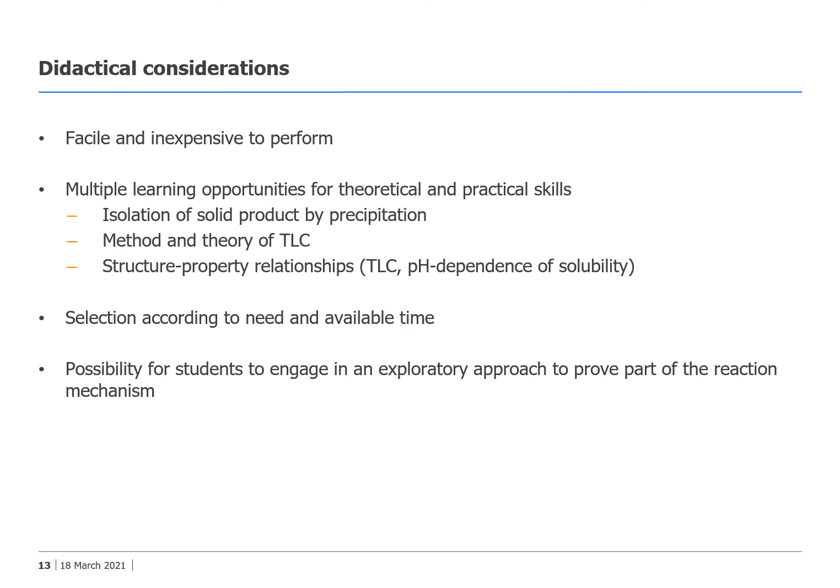Finally, the possibility should be mentioned to let the students engage in an exploratory approach to prove part of the reaction mechanism via the bromine verification using a detection method they are already familiar with.